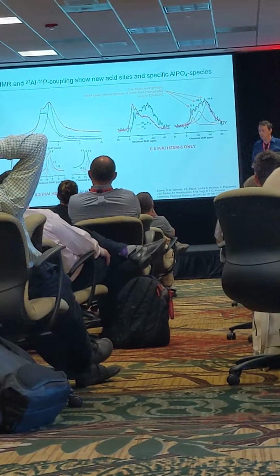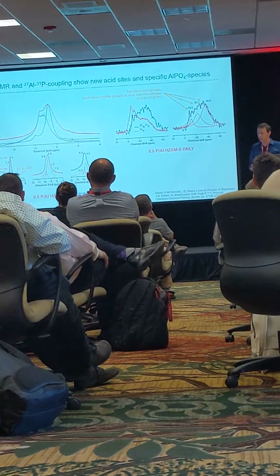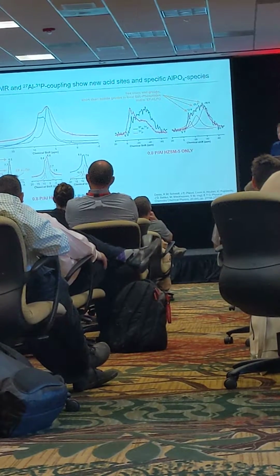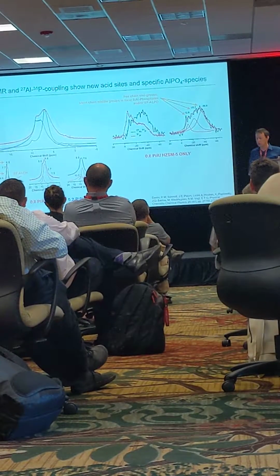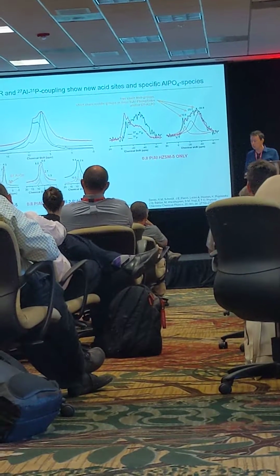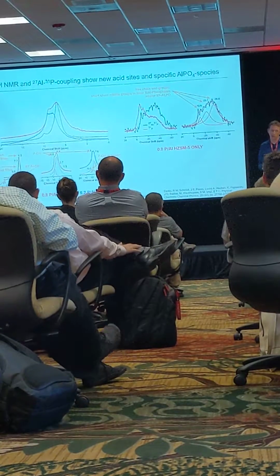Okay, so proton NMR data will tell us some more about the structure as well. I set the slide up in kind of the same way. We've got the parent ZSM-5 sample on the lower left. It's showing us hydrogen signatures consistent with extra framework aluminum OH, Bronsted acidity in the zeolite, and water on the Lewis acid sites. Then we've got some really interesting things that show up on the next two samples, okay?